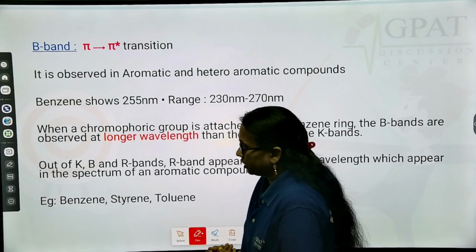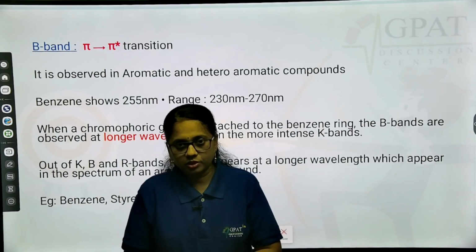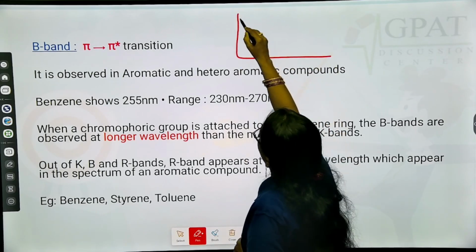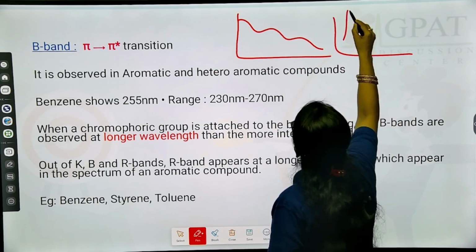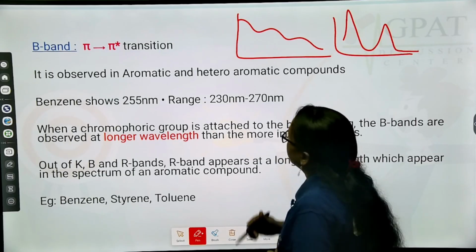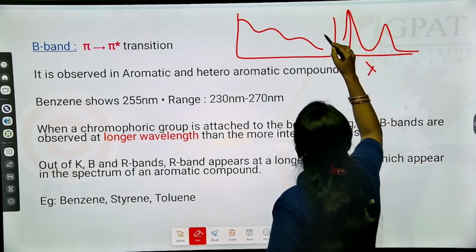If you look at the output of any UV spectroscopy, we mostly see a spectrum like this. If you want to know the lambda max, for some compounds you are going to see a very good peak shape, okay. So from this you will come to know this is the lambda max; we take wavelength versus absorbance.